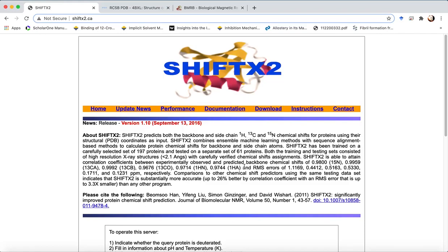You might see that these values often coincide with each other for different systems and different proteins. So in that case, a better assessment would be via the C alpha chemical shift or the C beta chemical shift, or from a secondary chemical shift, which is the difference between the actual chemical shifts of C alpha and C beta predicted by SHIFTX2 and the random coil chemical shifts that are predicted using different algorithms.